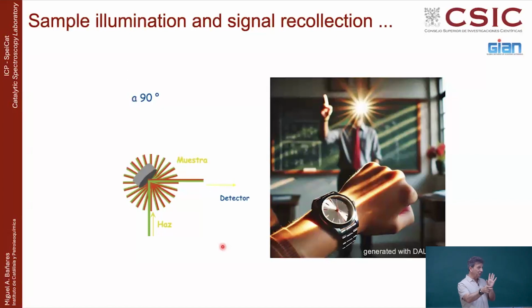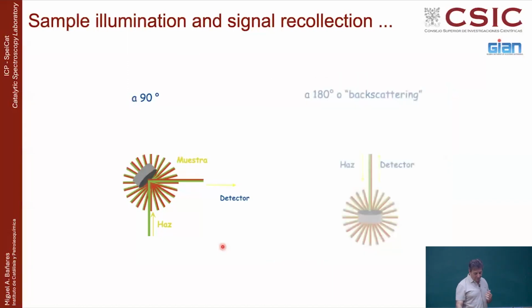So you play with it, you make a spectrum, nothing. You move, repeat a spectrum, nothing. And each spectrum was 20 minutes. So it takes a while. So the more you practice on reflecting light, that was good. But nowadays, we are basically working on backscattering, which is basically you illuminate and you collect. That makes things a lot more easy.